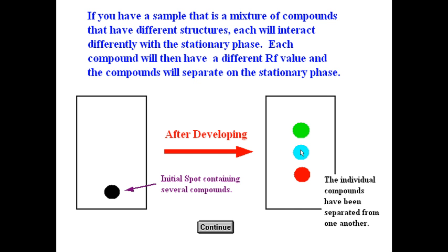One of the simplest tests you can do in forensic chemistry is to put a spot of an unknown material and another spot of a known material onto a TLC plate and develop them. If the two spots move exactly the same distance up the TLC plate, then that says that the unknown might be the known compound. So if I had some illicit drug sample, or I thought it was an illicit drug, I might put a spot of that against some known drug. And if they move the same amount, then it would tell me, well, this could be that illicit drug.